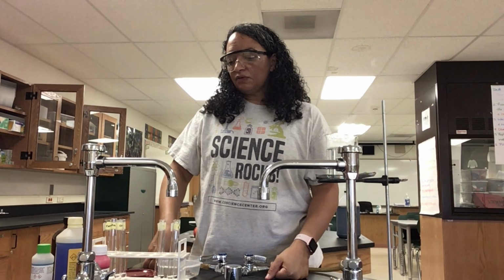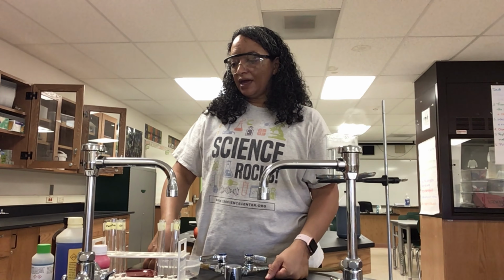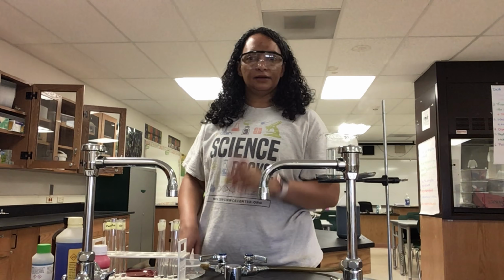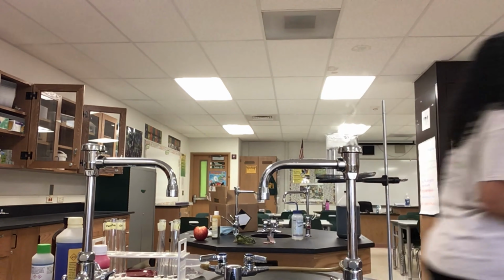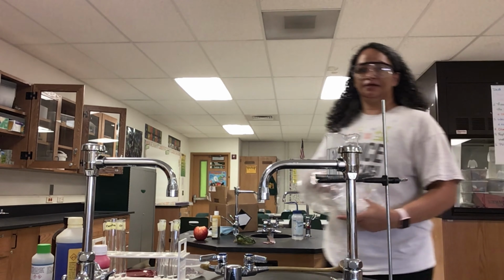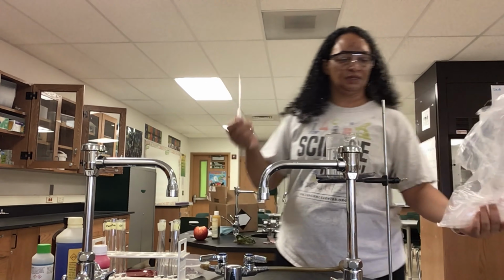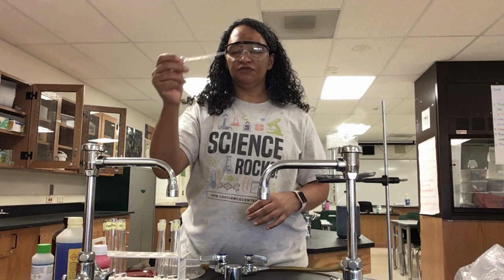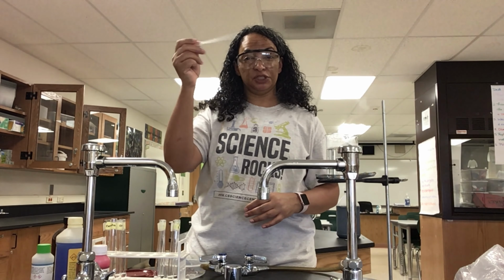So the first thing we're going to test for is we are going to go ahead and test for starch. That's the easiest one. Oops, I just realized I forgot something. Just when you think you're prepared, you realize you forgot pipettes. So I got my little pipetter here, and I'm going to use a different pipette for each of my indicators just to make sure I don't mess up.